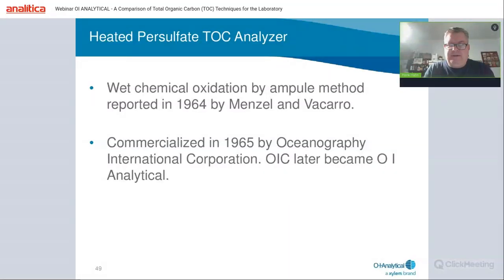The heated persulfate technique, wet oxidation by the ampule method, was first reported in 1964 by Menzel and Vaccaro, and commercialized in 1965 by Oceanography International. OIC later became known as OI Analytical.